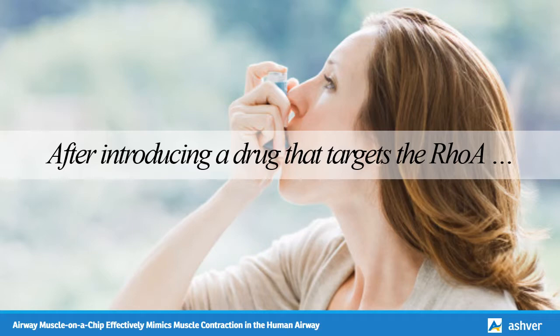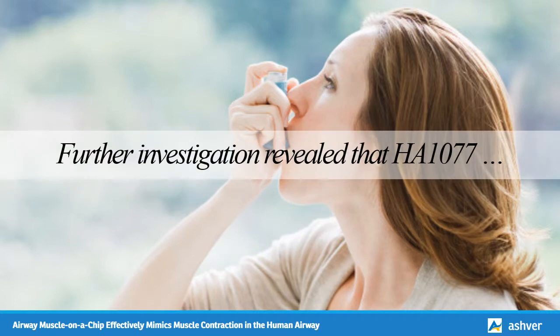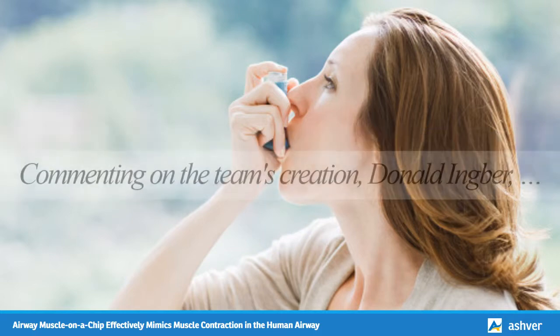"This result indicates HA-1077 decreases the basal tone of our engineered bronchial smooth muscle tissue and prevents hypercontraction," the team explained. Further investigation revealed that HA-1077 combined with an already existing asthma drug, isoproterenol, was more effective in reducing response to asthma triggers than isoproterenol alone. This means the airway muscular chip has already shown promise in identifying a potential new asthma treatment.